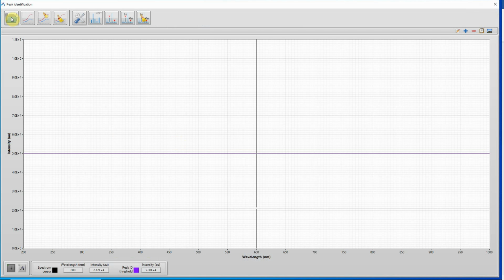Load Saved Spectra. Select and display spectra previously acquired using LIBSOFT. Compare Spectra. Select saved spectra for comparison with the analysis spectrum. Clear Comparison Spectra. Clear spectra loaded for comparison, leaving just the spectrum for analysis. Clear All Spectra. Clear the analysis spectrum and spectra loaded for comparison. Open Peak ID Configuration. This displays the screen used to configure the Peak ID parameters.